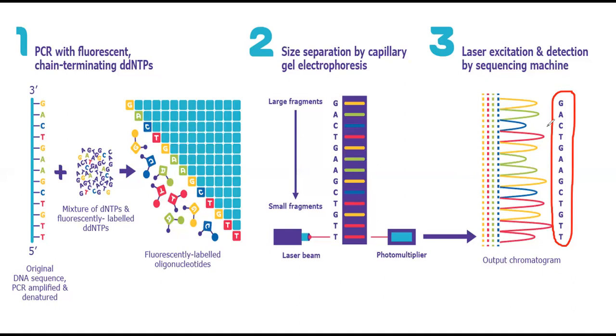So there is a video on how you will perform BLAST, and what is BLAST? You have to compare and align your sequences with other sequences. The more the comparison between the nucleotide sequences of the microorganism, the more you will know that you are dealing with this microorganism. So check the videos about bioinformatics, and there you will know how you will compare your entire genome with other genomes of microorganisms.